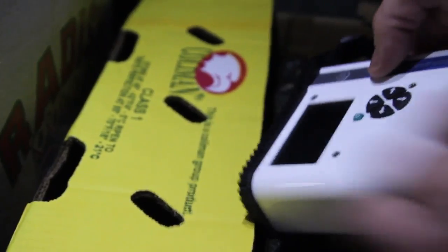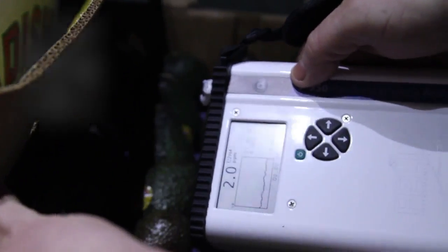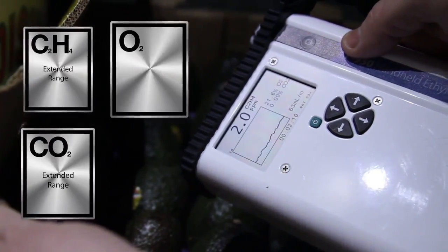Simple to operate and weighing less than 1 kilogram, the F950 records ethylene, carbon dioxide, and oxygen concentrations as well as date, time, relative humidity, and GPS location.